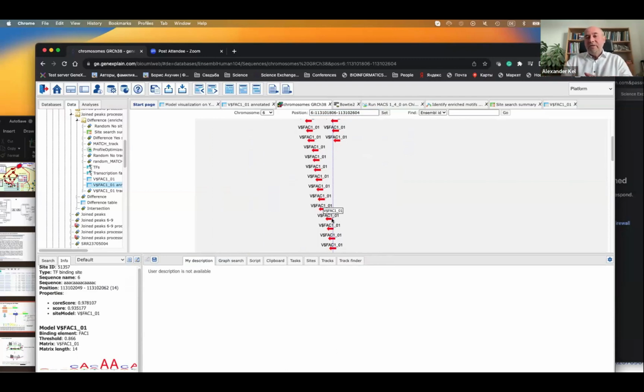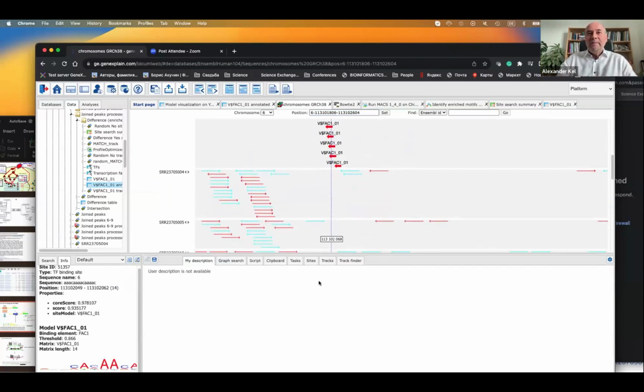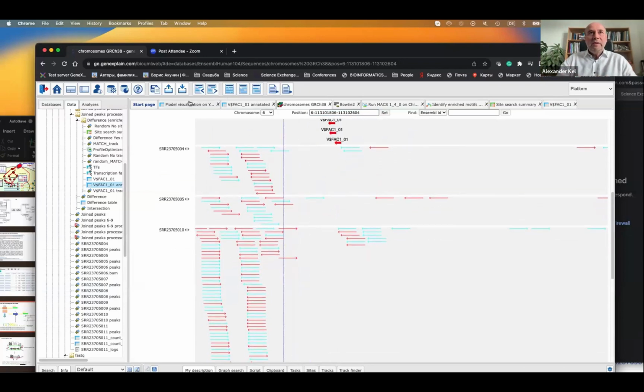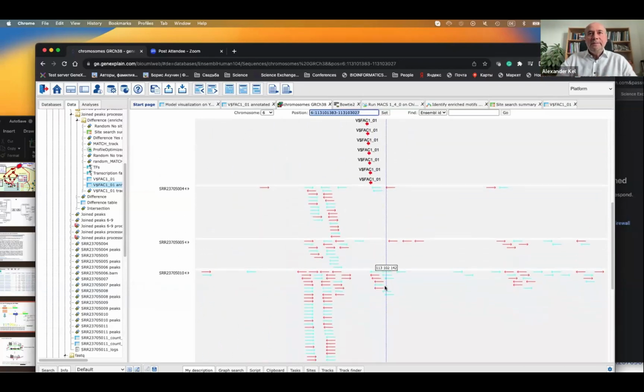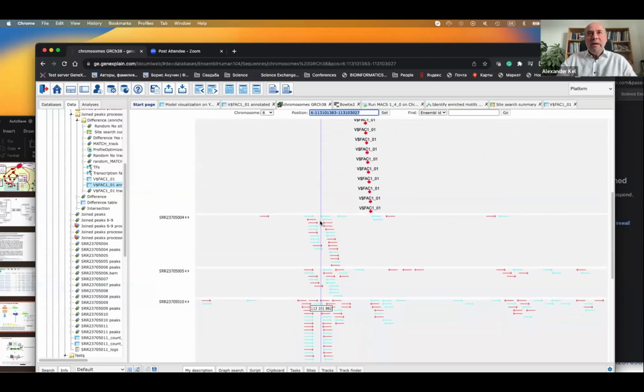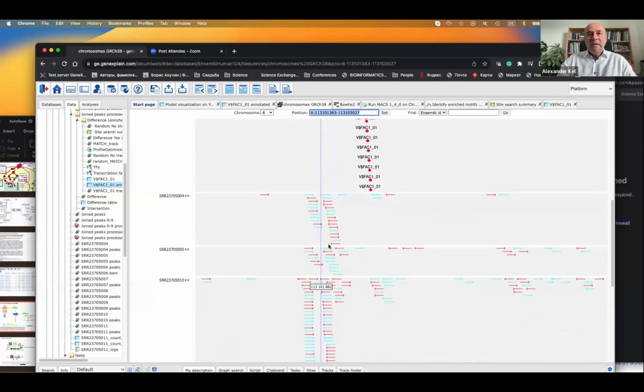And that triggers those ATAC-seq experiments, because this area was opened because of these factors, and these factors occupied this place. Interesting, we actually also see this valley here, because if you zoom a little bit down, for instance, in this knockout, in the wild type experiment, you see the peak of the reads.